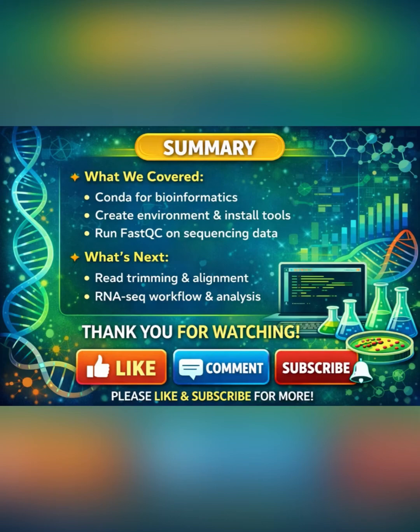In upcoming videos, we'll move forward into more practical steps, including read trimming, alignment, RNA-seq pipelines, and advanced bioinformatics workflows using conda and HPC.